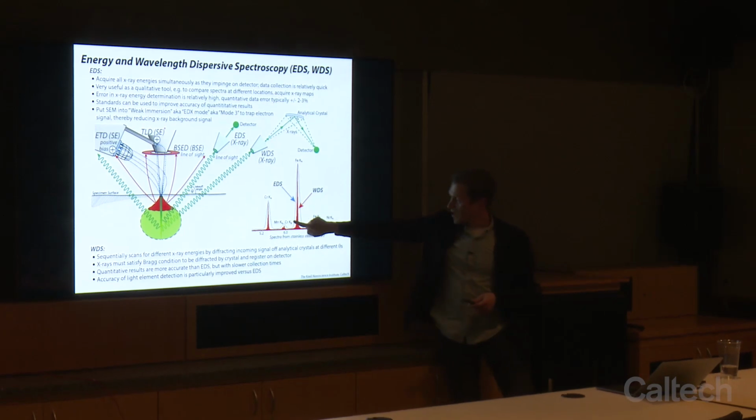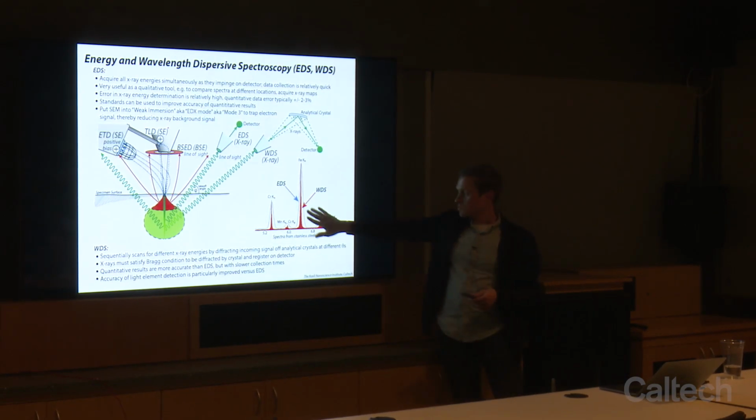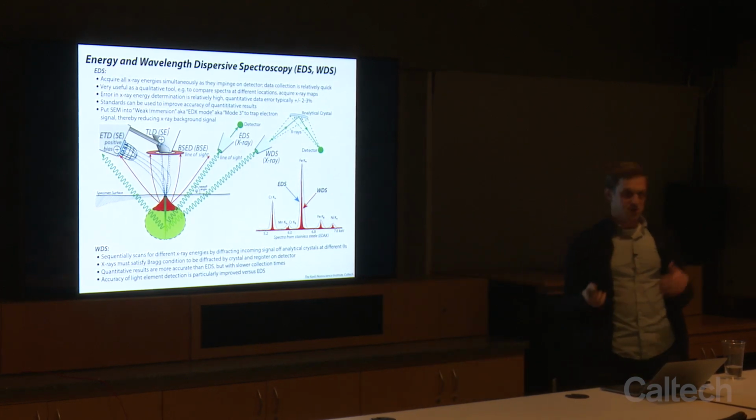So here the outline is EDS. It's going to be a broader spectrum, and the WDS will be much sharper. So you can get better quantification with WDS, but it's a slower technique.